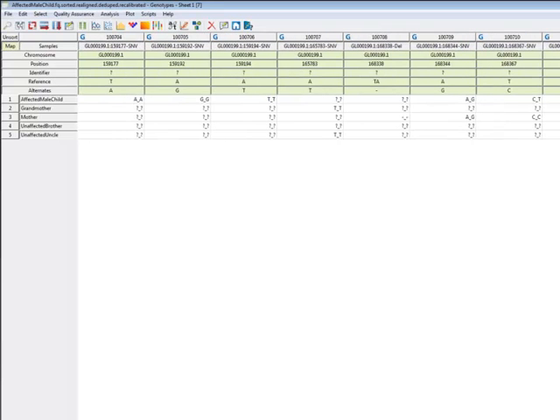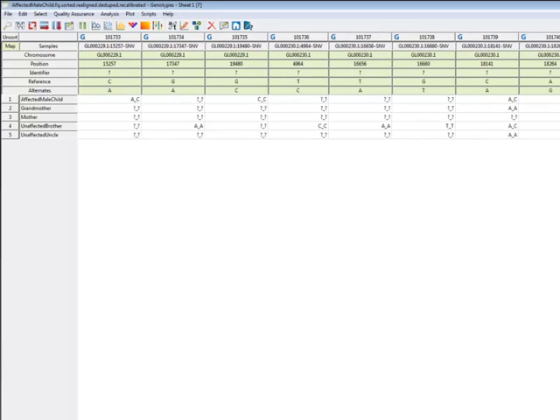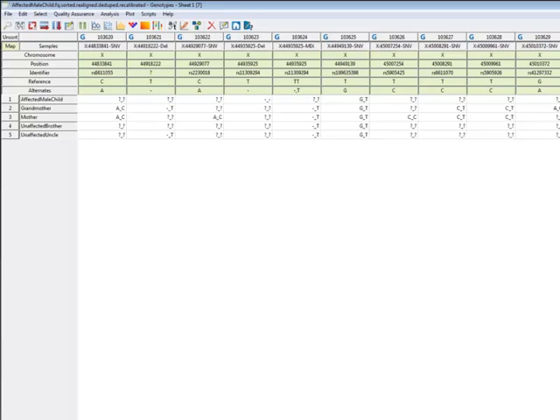Now, this particular data was collected using X chromosome-only exome capture, but there's still a lot of bleed over into other regions of the genome with the capture kit. You'll see that a lot. We probably have people here doing targeted sequencing analysis, but target capture is never totally perfect.